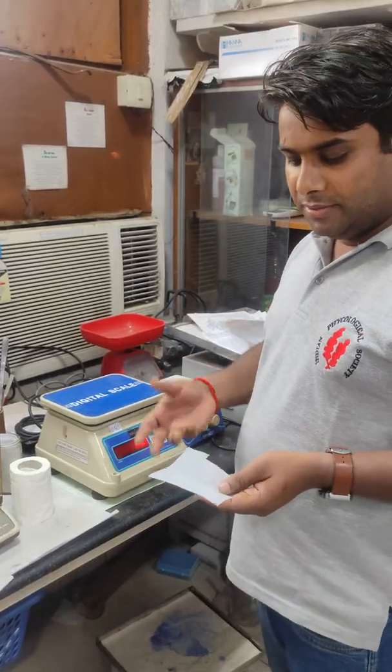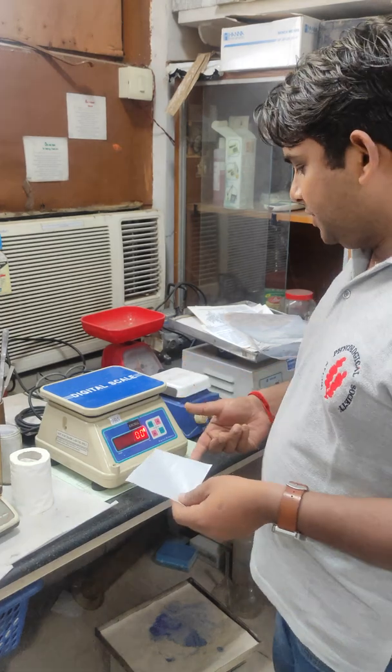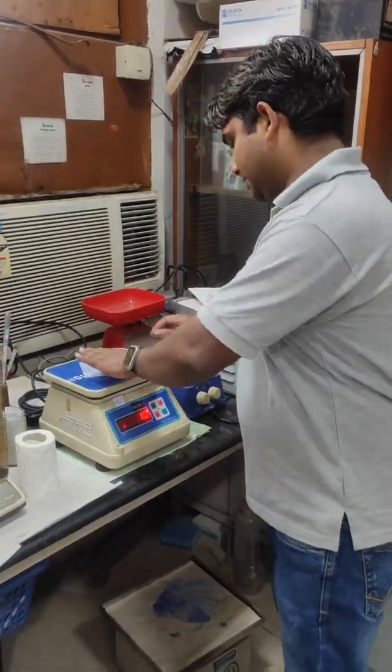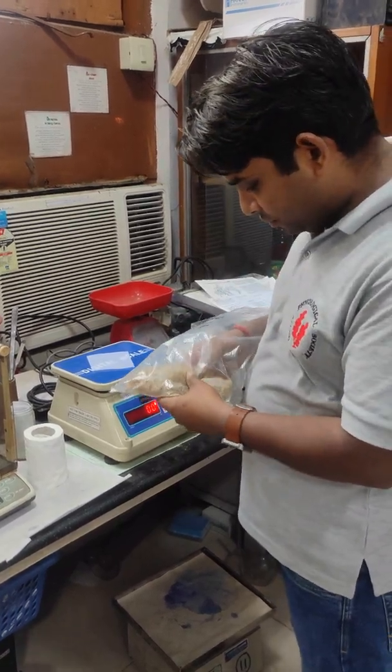The first step for the extraction of agar is to weigh the material. First we take 1 gram of material from the stored material. Now I am just going to weigh the material.